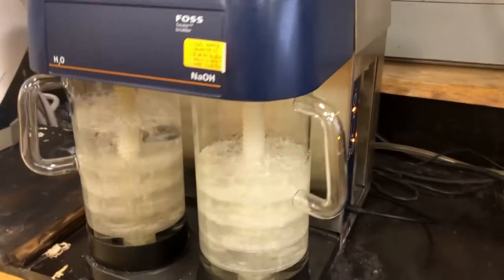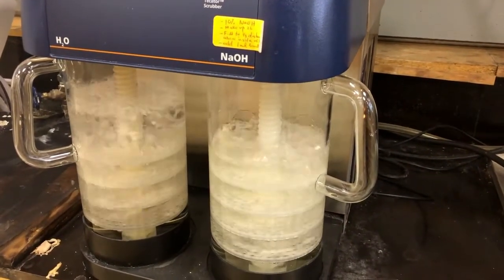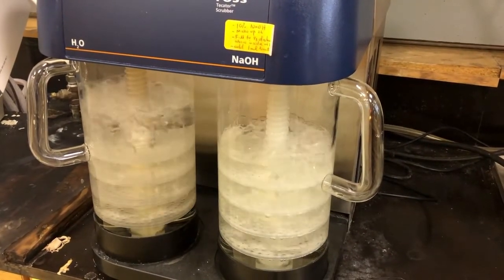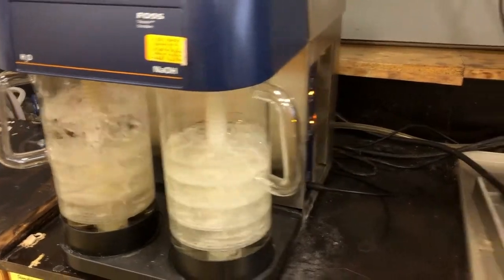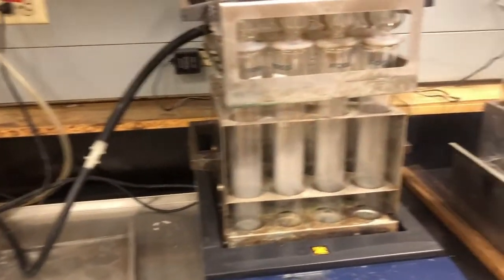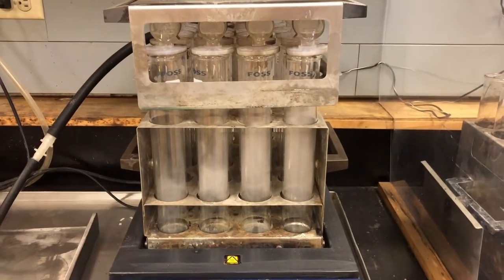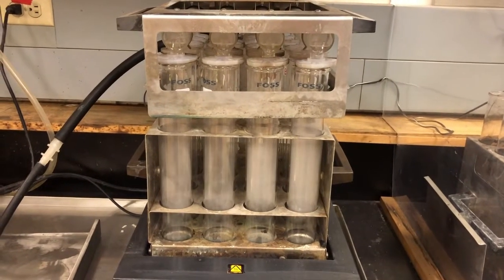So this works in that it has two solutions that the vapors are bubbled through. So we have a sodium hydroxide and then a water. And what that does is it neutralizes those acidic vapors that are being given off by the samples in the digestion block. So that's pretty much ready there now. So I'm just going to turn it off. We're going to let it cool down, and we'll be back shortly.